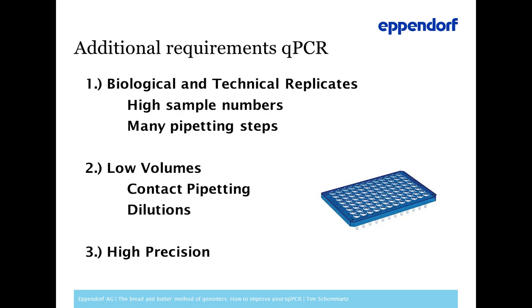Okay, there are some additional requirements for qPCR, which I think you are aware of. In order to do qPCR, you need a lot of biological and technical replicates to get reliable results.